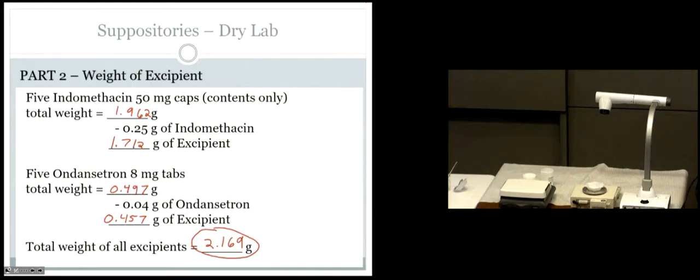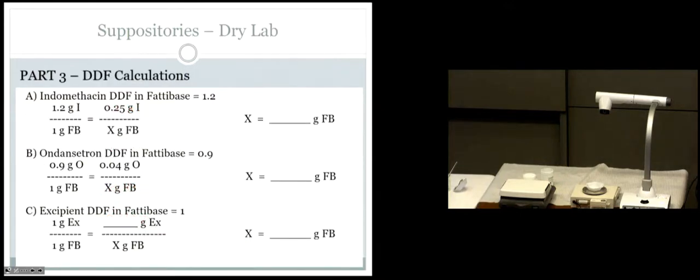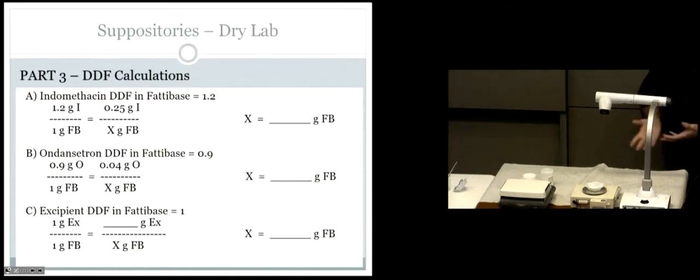Does it make sense? So we are going to be putting those weights of drugs into our liquid base. Our next step is to calculate the weight of base being displaced by that drug. So these direct weights don't matter in our next calculation. We have to convert them. That's where the density displacement factors come from. And so I set them up like this.